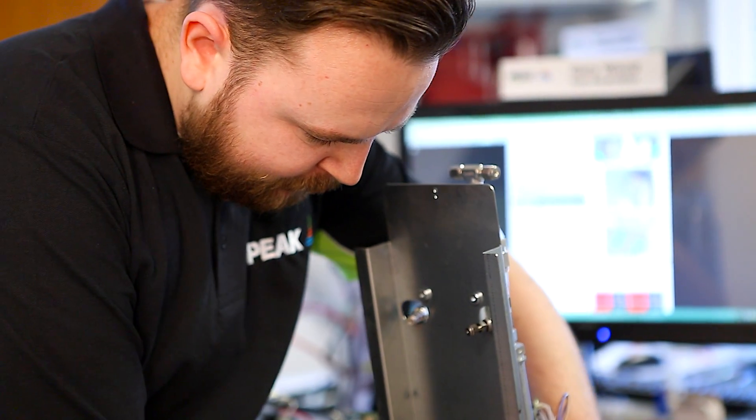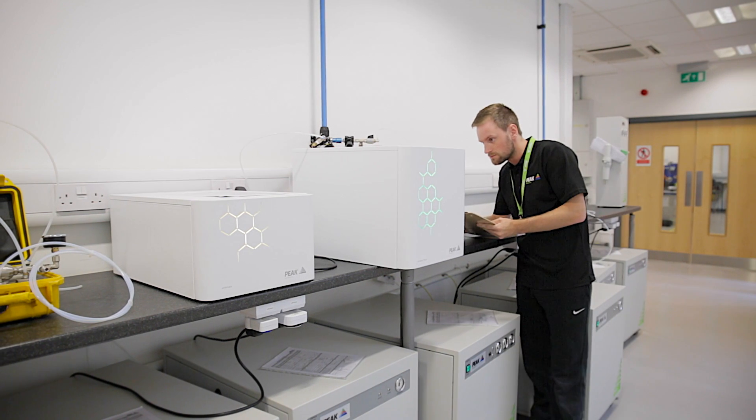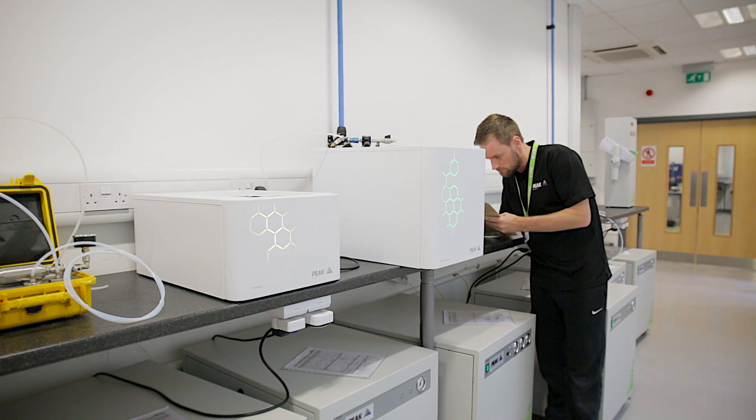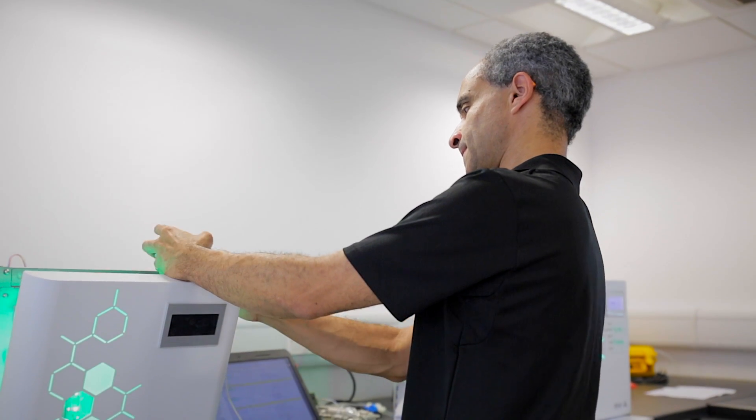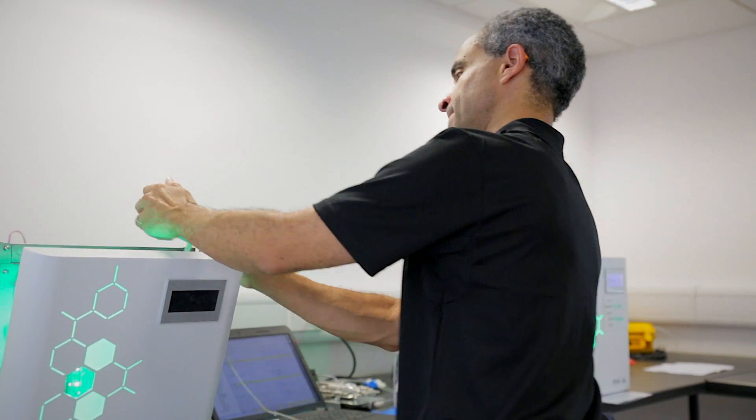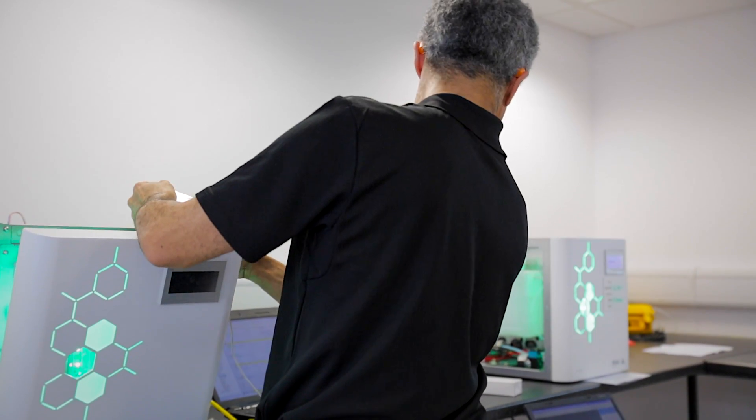This allows us to make sure that we're producing a build of consistent quality, which we're able to track through from the individual components right through to the finished article. We're also able then to have consistent quality control in-house before we ship units out to the customer.